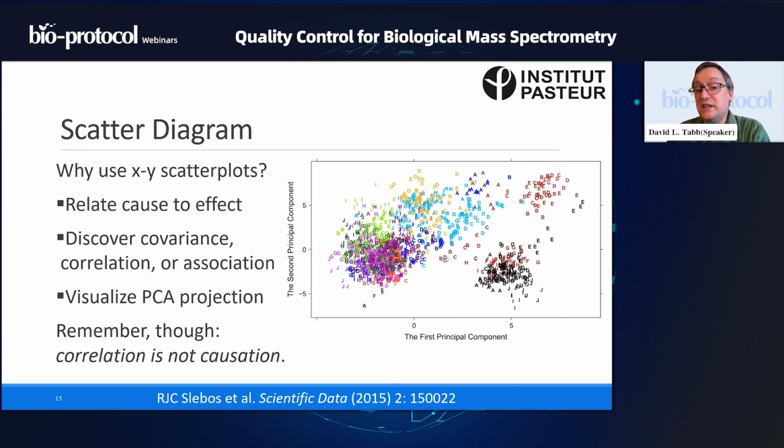Okay, so why do we need to use XY scatter plots? Ishikawa had several things to discuss about this. His first was that he wanted to relate a cause to an effect. So if you had an X coordinate that reflected, say, the temperature of a part of the instrument, and a Y coordinate that said how many of the spectra did we identify, you might be able to make the argument that if there's a strong relationship between these two values, one is causing the other.